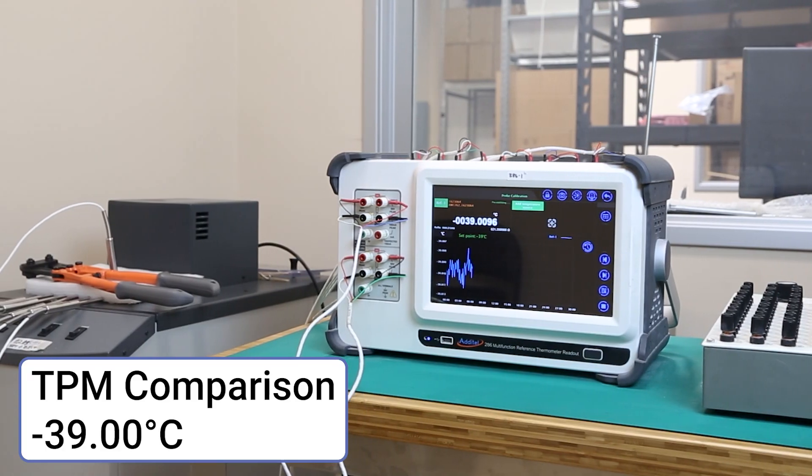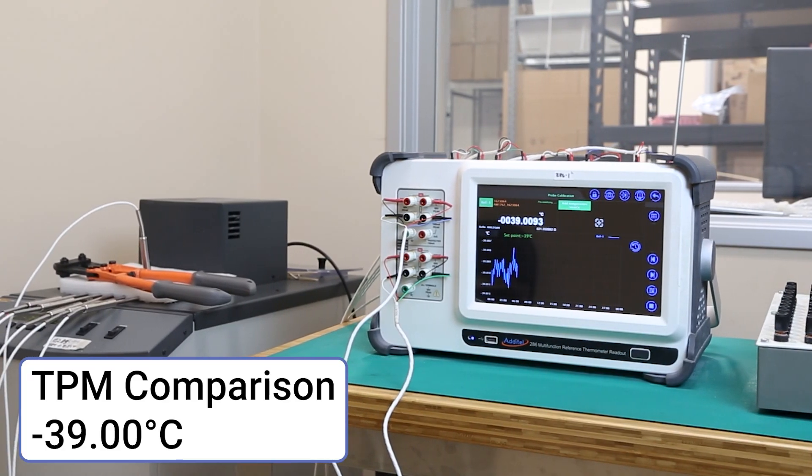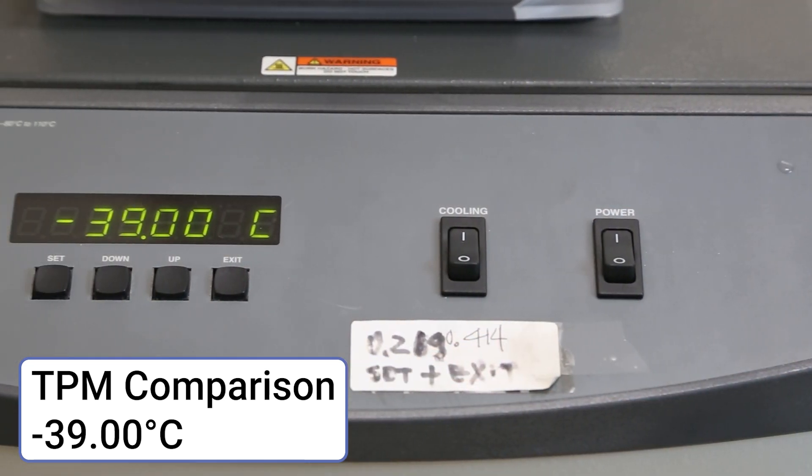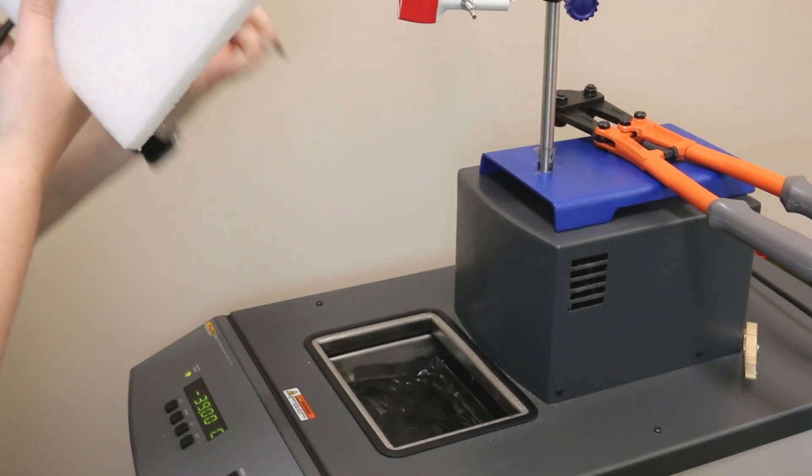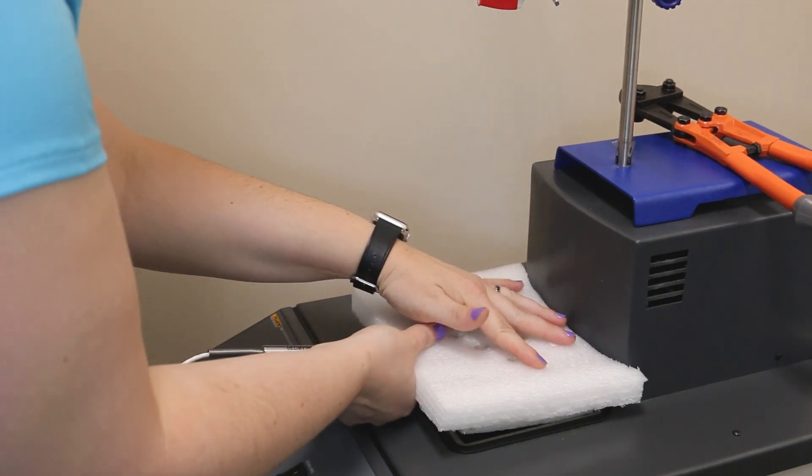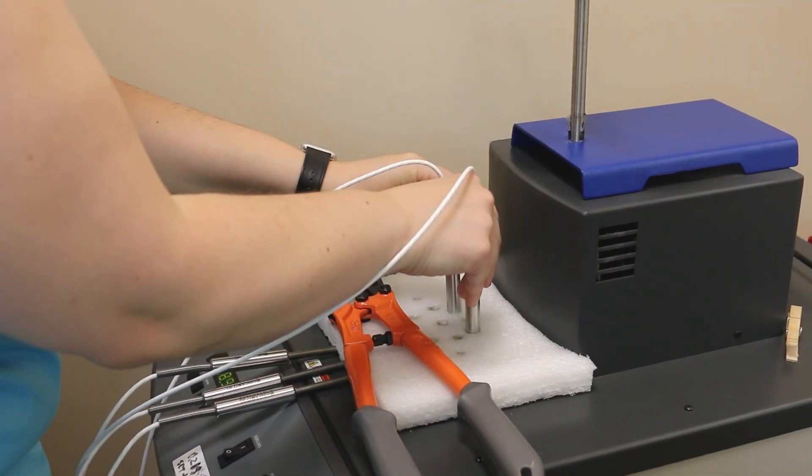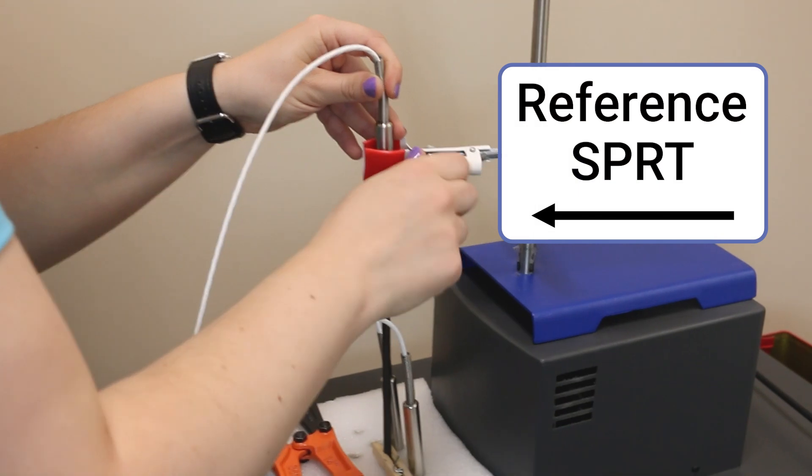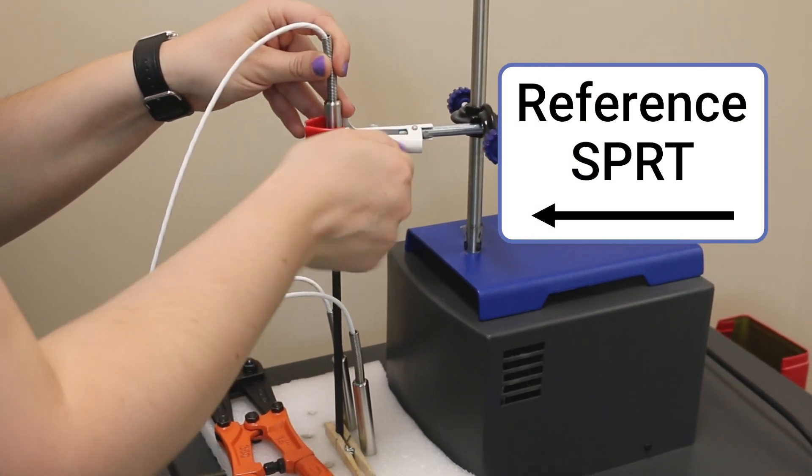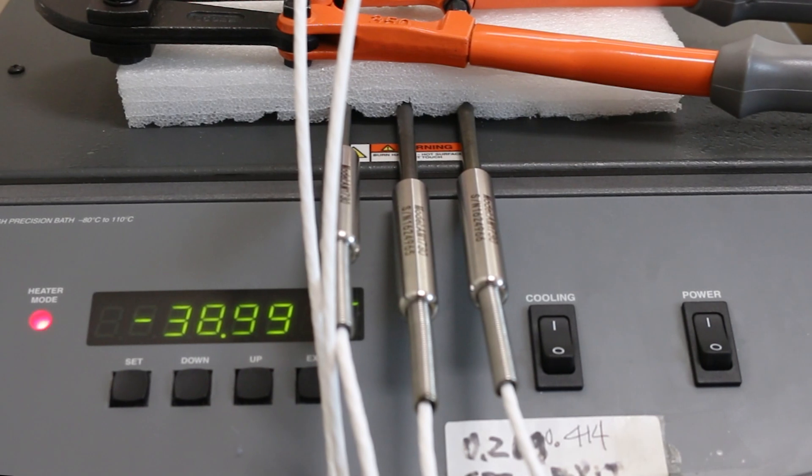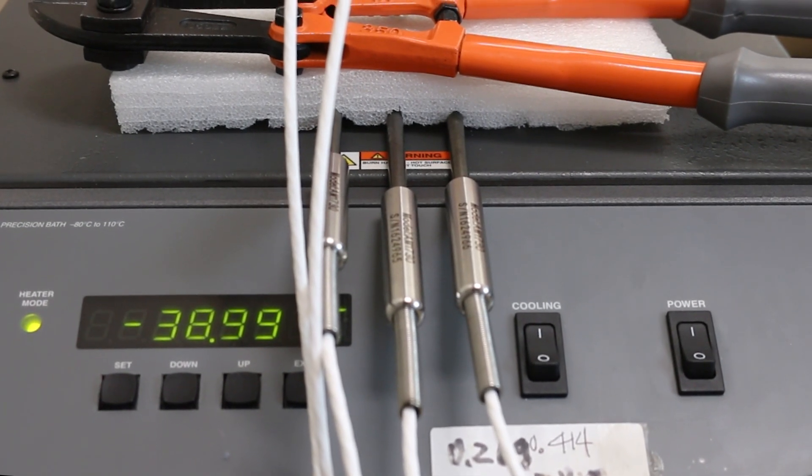Instead of a mercury cell, we will use a comparison calibration at negative 39 degrees Celsius. Comparison calibration points can be used in place of fixed points in order to complete a calibration without having the equipment to actualize fixed points. To replace the intrinsic reference, a reference SPRT must be used throughout the test, which will be compared against the DUT probe readings.